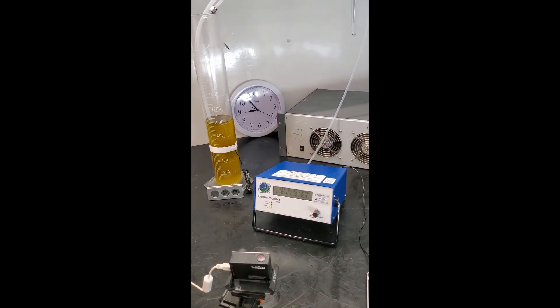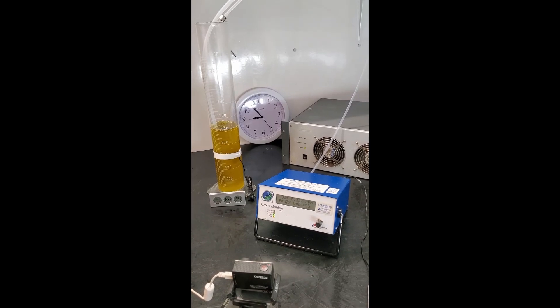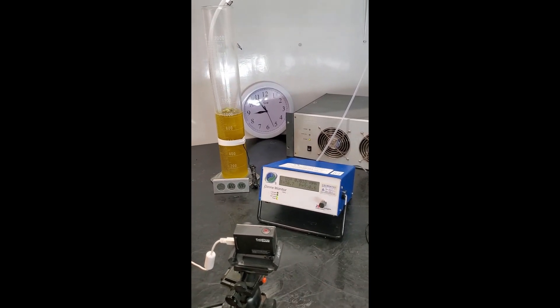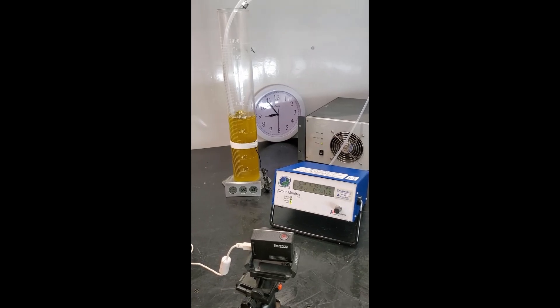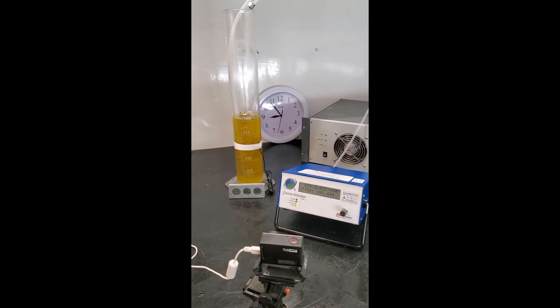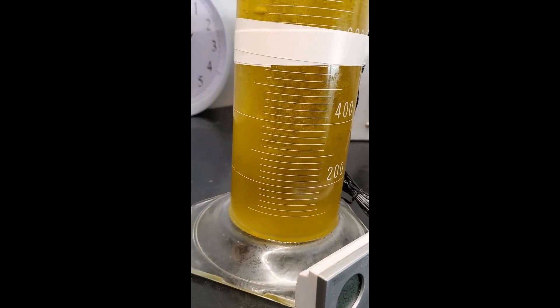The ozone generator here is the RMU K6. We've got a two-liter reactor with about one liter of olive oil, and we're flowing air into ozone at about one liter per minute. From that air and ozone we're going to produce about three percent ozone by weight, which will be about two and a half grams per hour of ozone.